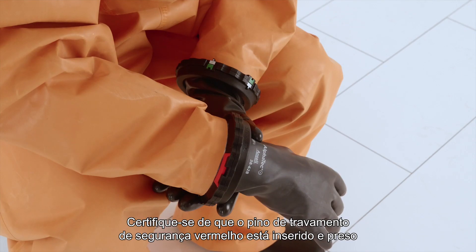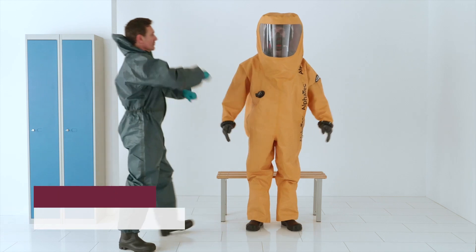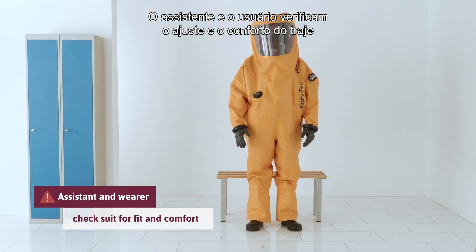Make sure the red safety locking pin is inserted and secured in the bayonet glove ring system.